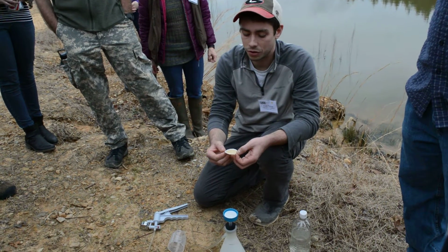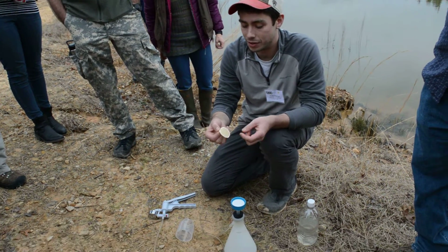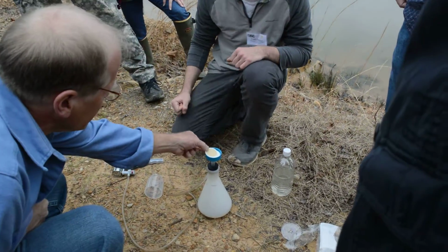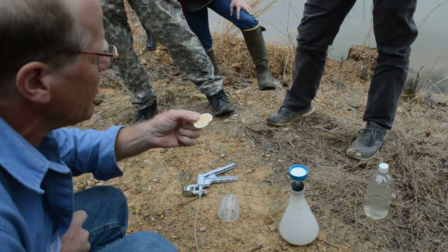But this you can store it lots of different ways. You can fold it up, and the DNA is bound within the membrane right now. Oh, interesting. Is it gridded, or is that just? It is gridded. That's just, yeah.